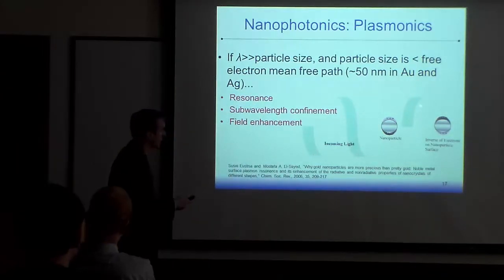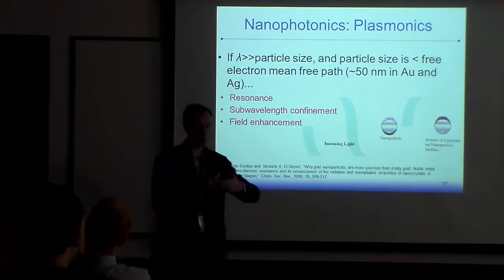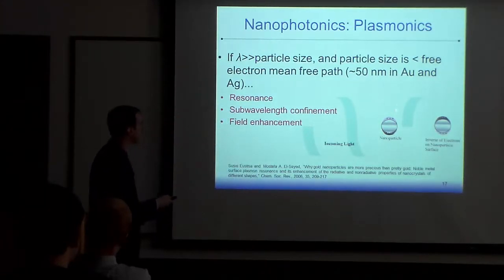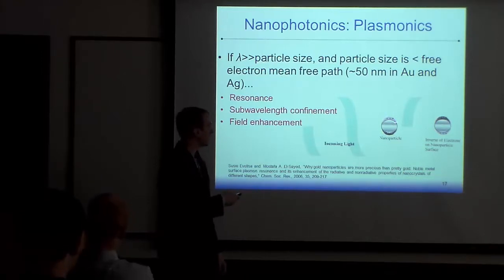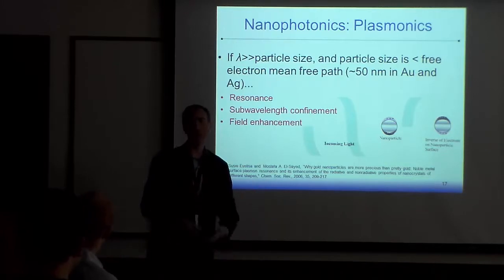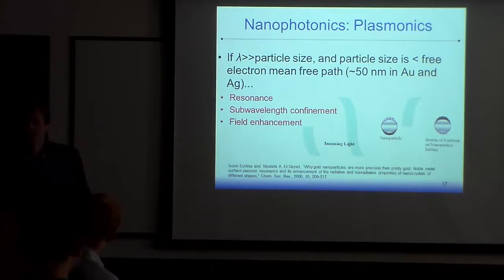You get absorption. You get this sub-wavelength confinement of very intense electric fields on either side of the particle, depending on what phase of the light is currently incident on the particle. So you have this very tight confinement and very high field enhancement. And there's a lot of science going on right now using these gold nanoparticles to do really small measurements of things right on the surface, on the order of single nanometers. Oh. Yes. So this phase distribution of the nanoparticle, like the length itself, what does it correspond to?